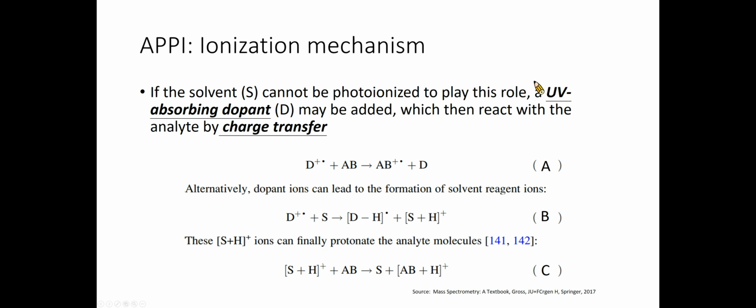We mentioned that photoionization is not a favored process. Instead of relying on direct photoionization to occur, one normally would prefer a chemical ionization process where the reagent ions are formed by photoionization of a reagent gas.